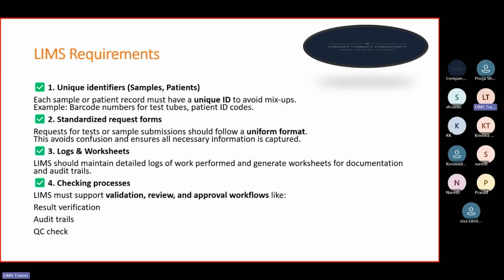So implementation is a very vast topic, and you will require a lot of time to implement a software in any laboratory. It can take 8 months to almost 1.5 years.